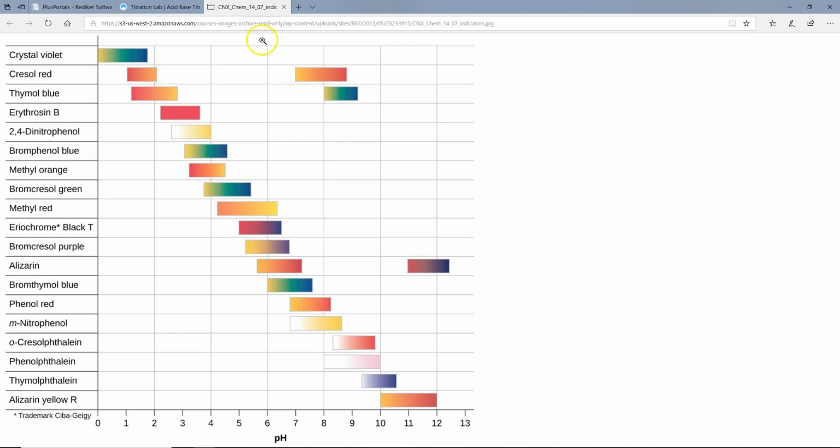I know that's hard. So if we're looking at the pH here, we are starting with a basic solution and going to hopefully 7 or 8. Phenolphthalein really will work in there, but there are others that'll work too in that 7. Some of those we don't have as options, so you kind of have to look at what's going to be the best option to get me a color change when we're getting really close to that equivalence point. And phenolphthalein actually does work pretty well for strong acids and strong bases, because it starts to change colors closer to that 7-8 range.